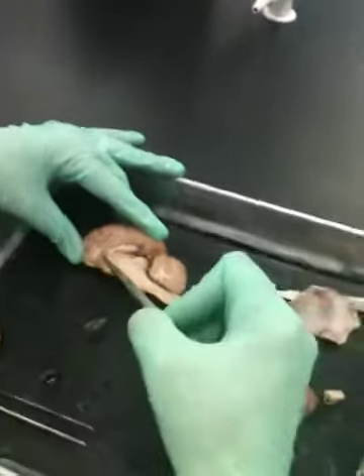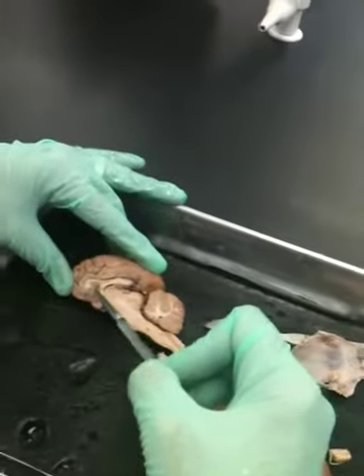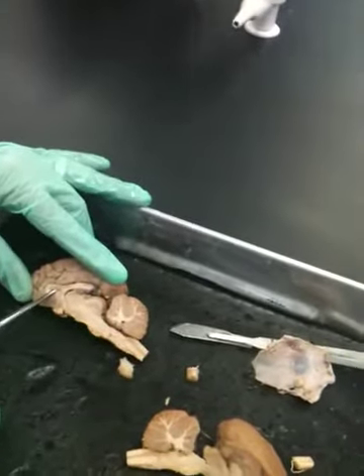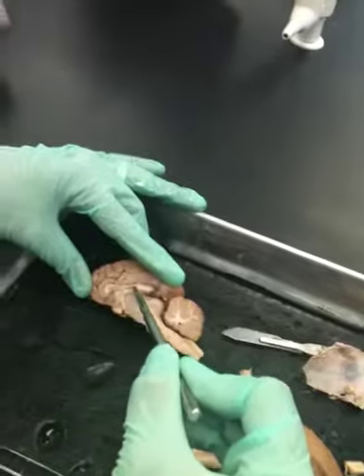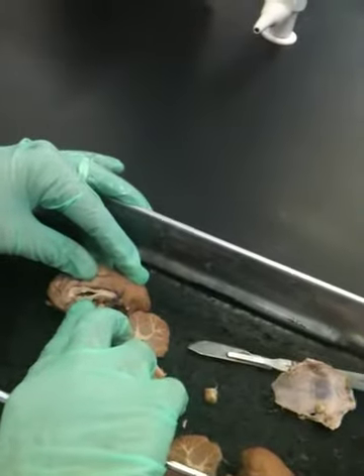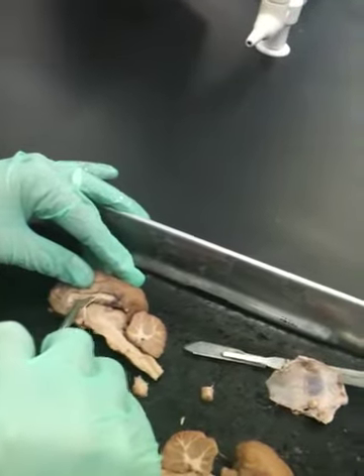All right, now this side has a tissue. What's this tissue? The septum, septum pellucidum. I'm going to pop through it, and then we're going to break it. Now, what cavity are you now looking at? The lateral ventricle. Perfection, lateral ventricle. What's this part? The fornix.